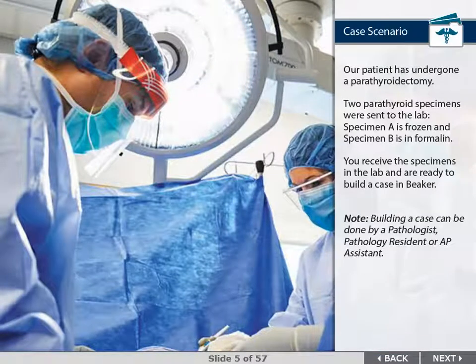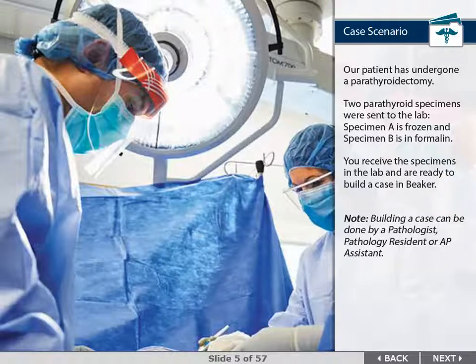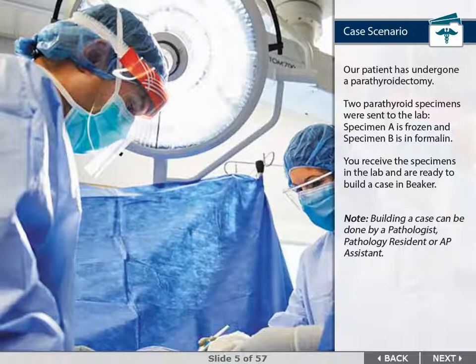Our patient has undergone a parathyroidectomy. Two parathyroid specimens were sent to the lab—specimen A is frozen and specimen B is in formalin. You receive the specimens in the lab and are ready to build a case in Beaker. Note that building a case can be done by a pathologist, pathology resident, or AP assistant.